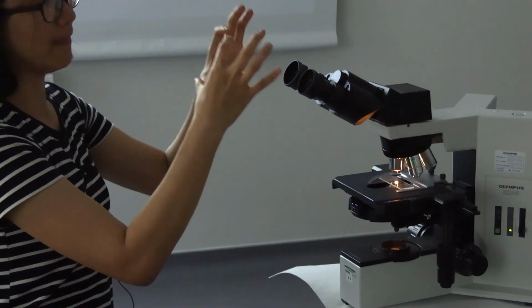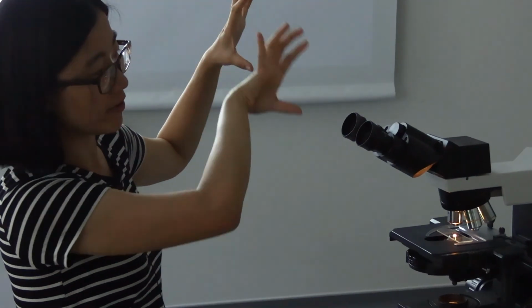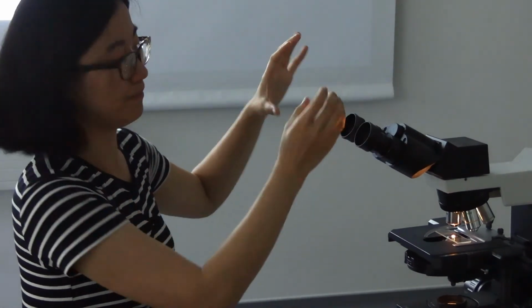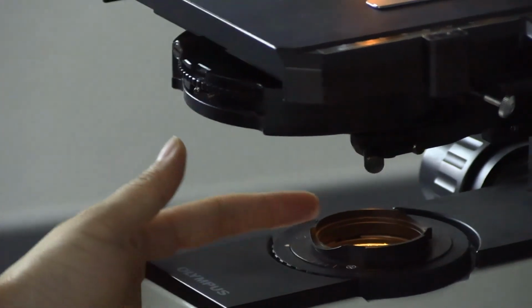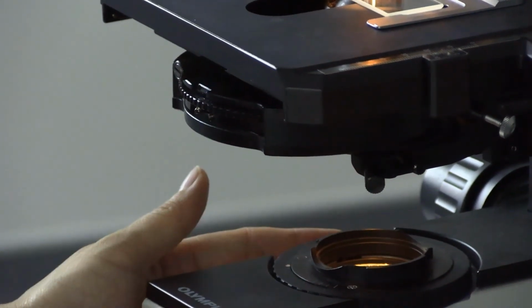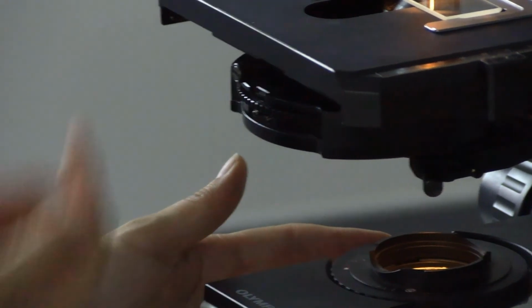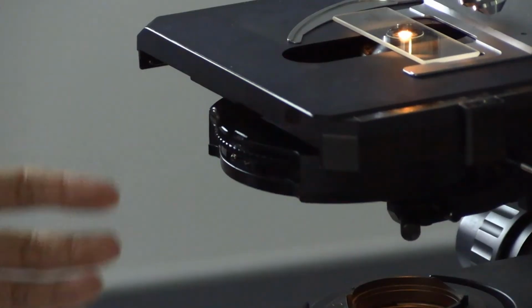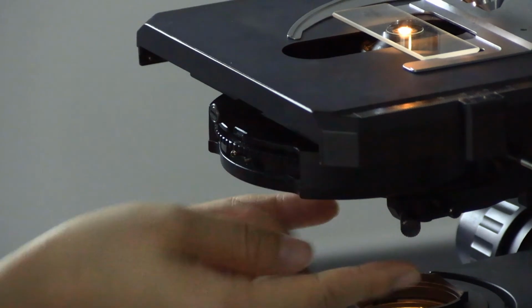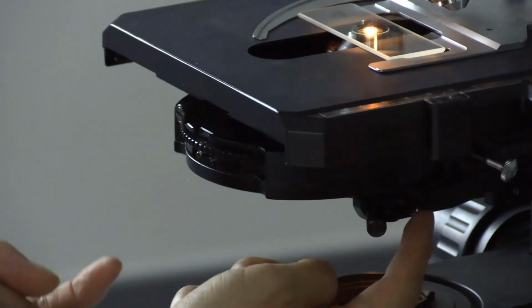And if it's not in the center, you will see that one side might be covered by the block, and on the other side you still have this distance. So try to adjust a little bit here, and get the condenser to the center, and then you will have the best image and best light path. Which screws was it? It is the screws here. Yes. So this one is for when you try to remove the condenser, the small one.